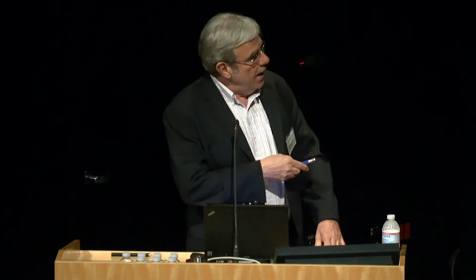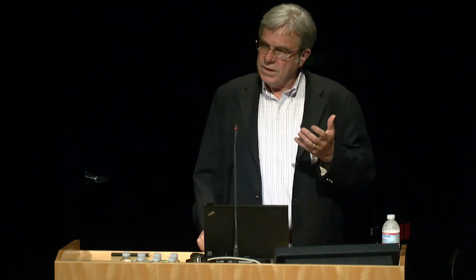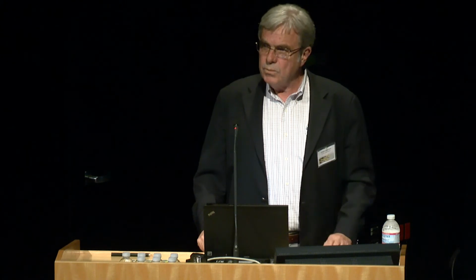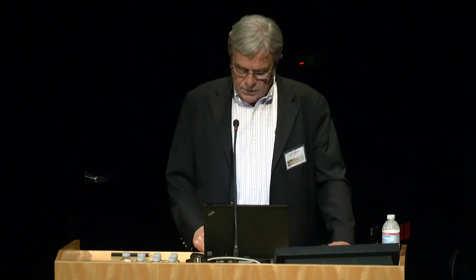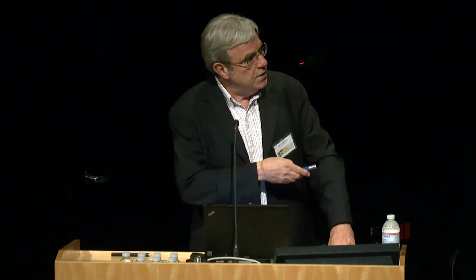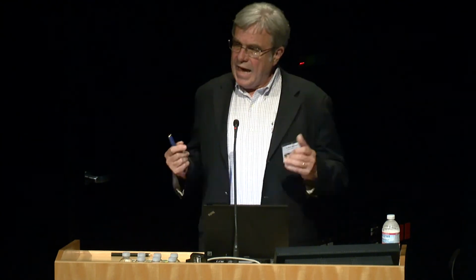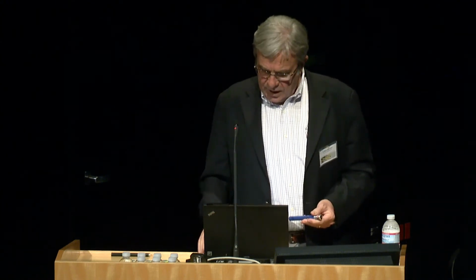Okay, so with that in mind, we get these electrical signals out of here. We amplify and filter them. We look at their shape. This is done with commercial Plexon software for those of you who do this sort of thing. And you can see in this example, there are two shapes. So we sort them into these two different stacks. And then we plot them out on a timeline like this.